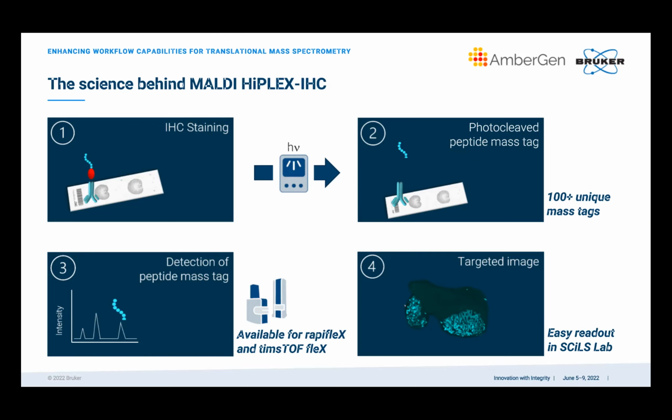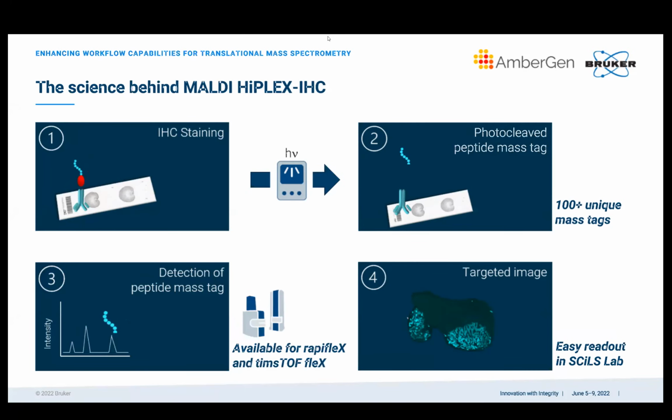So you're saying the technical variation in the system is pretty low? Very low. Your technical variation batch to batch happens not so much on the system itself, but on the sample prep side. Yes. It's critical to actually have cellenONE or something akin to it to minimize the batch to batch variation, because you're dealing with so little amount. If you're not careful about it, you're just going to be all over the place. You're not going to be able to make any sense out of it. Okay.